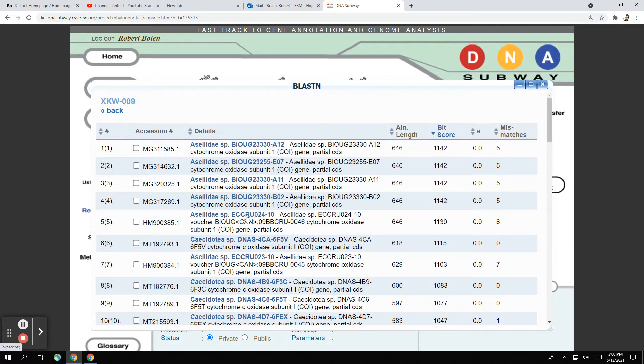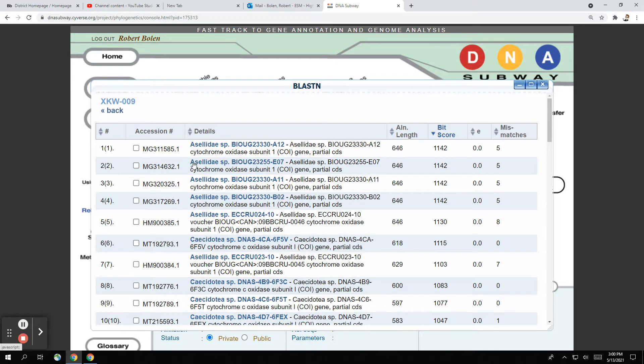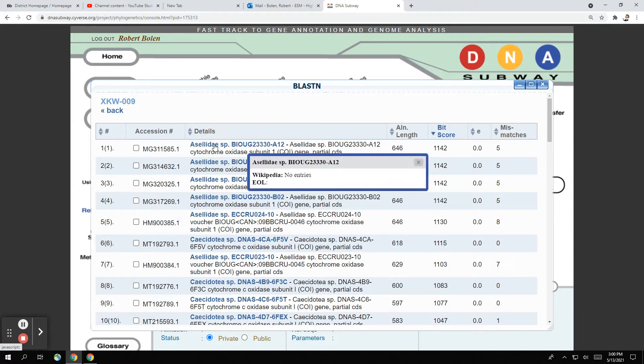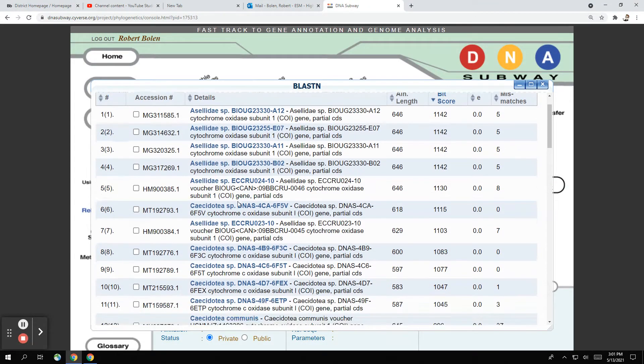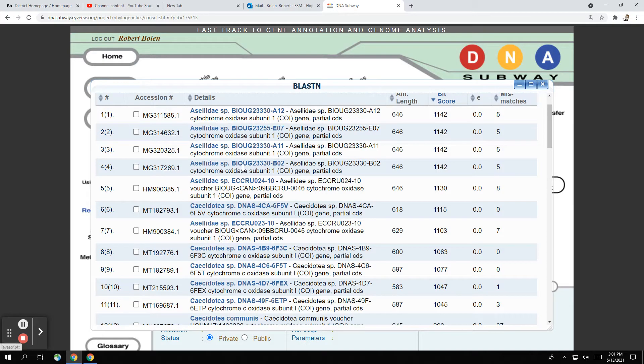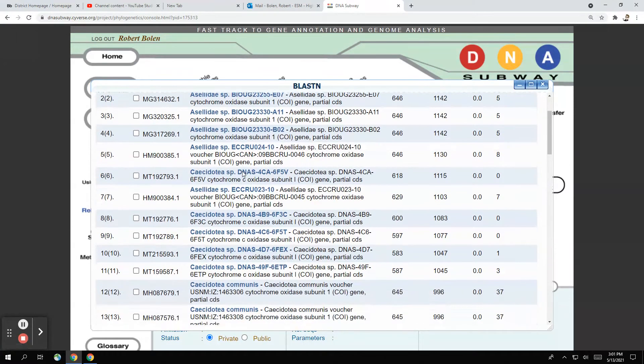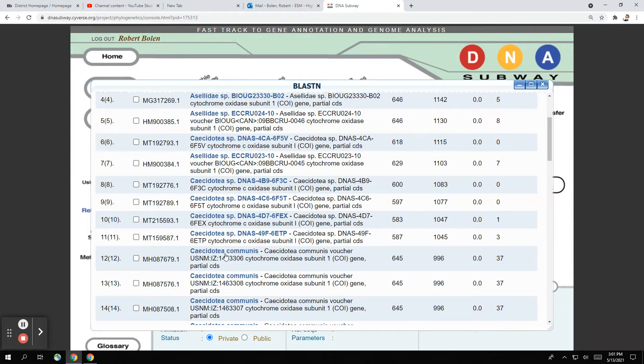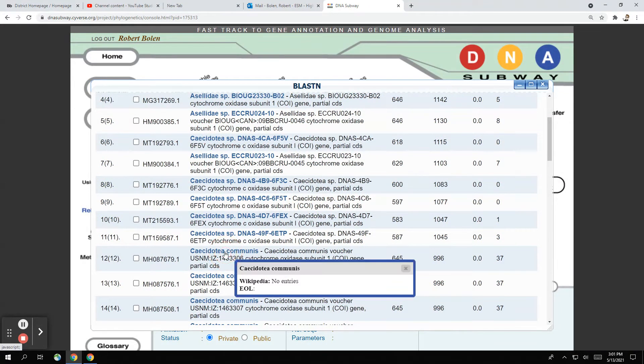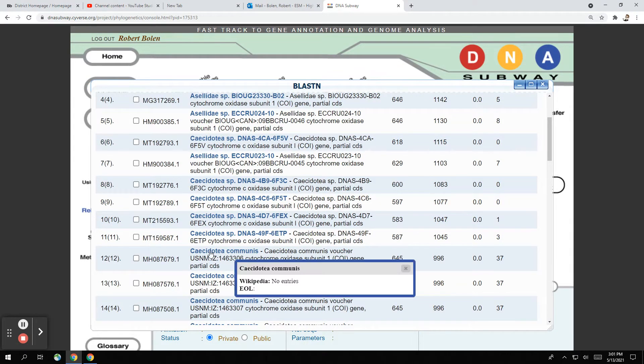So what you want to do is look for where you see a genus species name. All of these right here, this is called Asellidae. That's a family of different types of organisms, which we can't even see right now. The picture doesn't pop up. So what you want to do is scroll down until you get to this first one, which is Caecidotea communis. And if you click on that, usually it shows an image, but this is most likely our best hit that we can get.